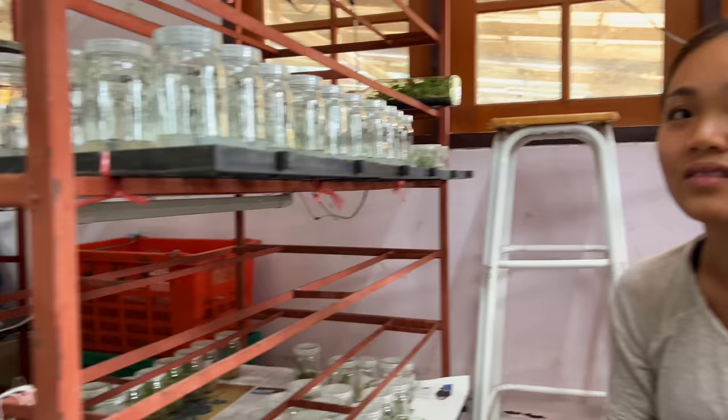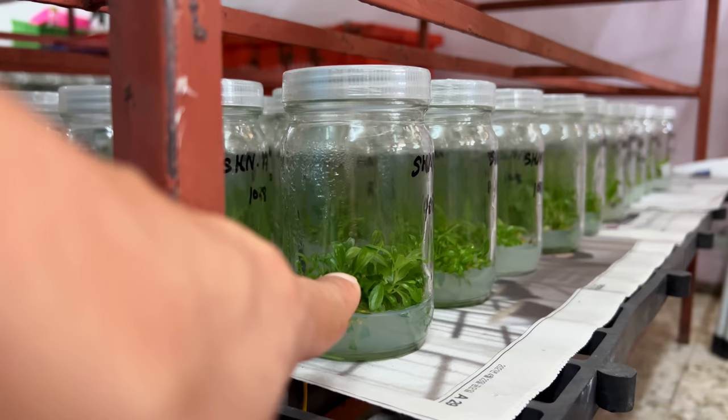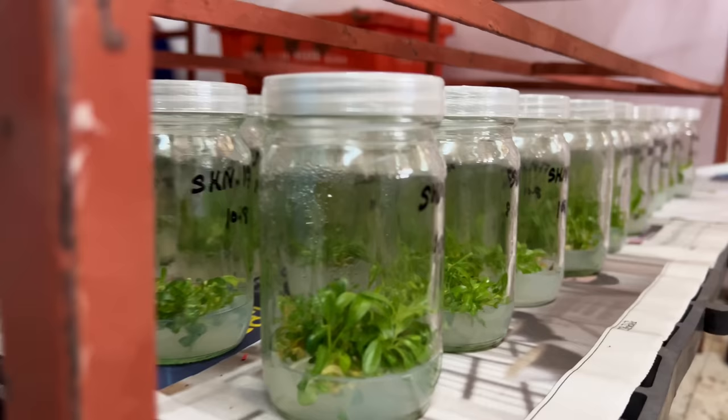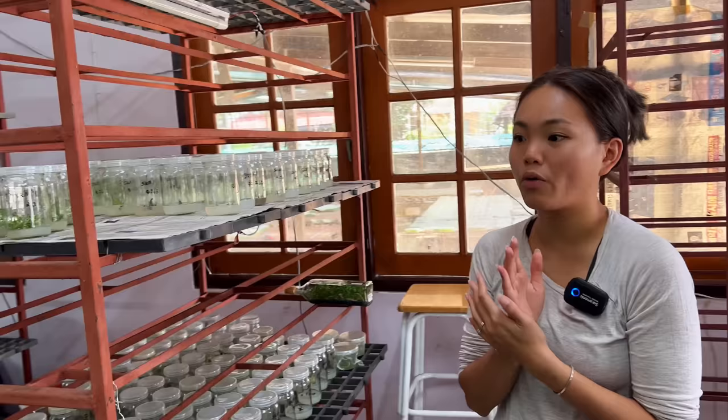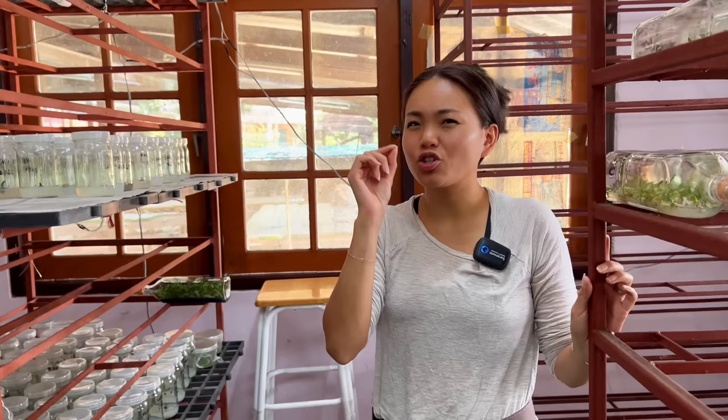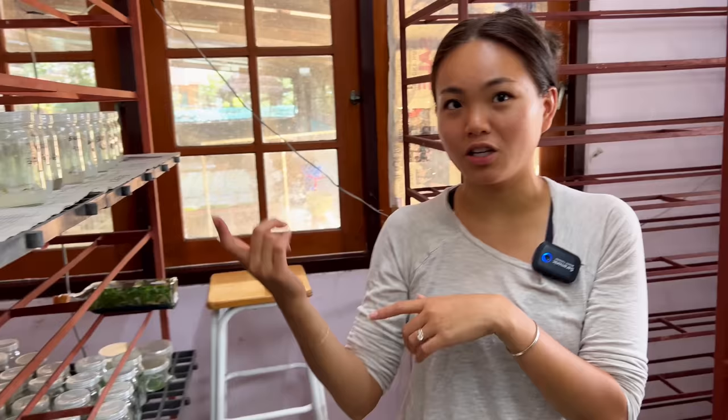For this one and the Thai con, do you use the same solution? No. When we first put them in the lab, we always use a standard recipe and then observe — if it's growing way too fast, those aren't strong plants. They're growing tall but not healthy. So you change a little bit of the recipe. There's one standard one used most of the time and you make tweaks. Same thing with orchids — we tweak all the time.